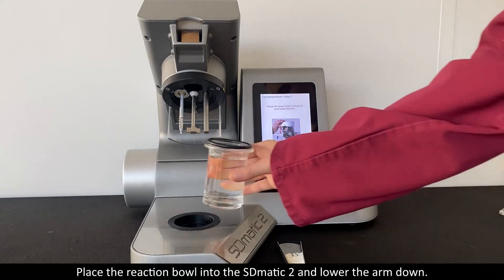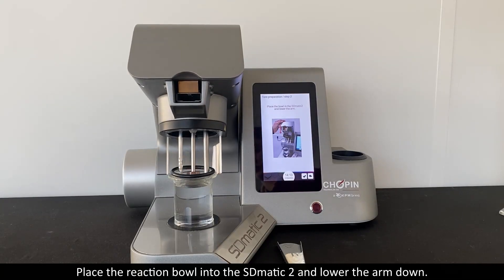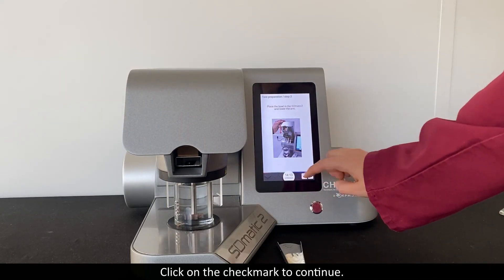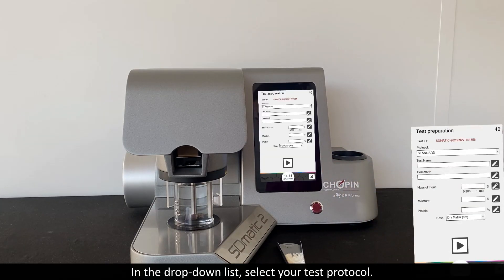Place the reaction bowl into the S-Domatic 2 and lower the arm down. Click on the check mark to continue. In the drop-down list, select your test protocol.